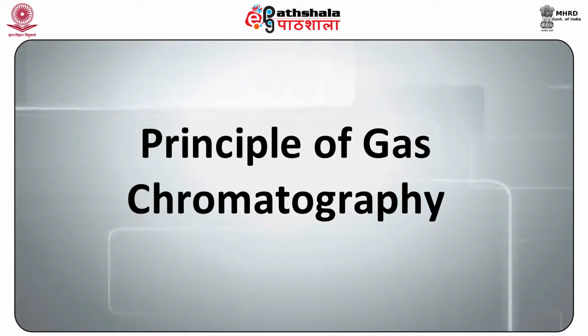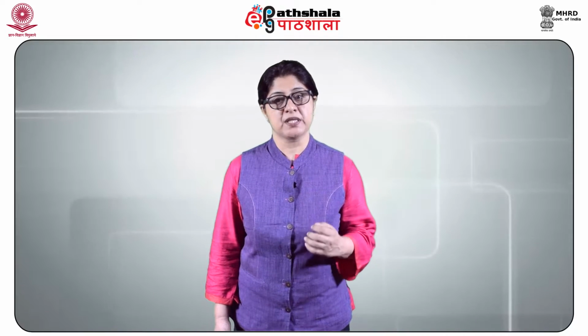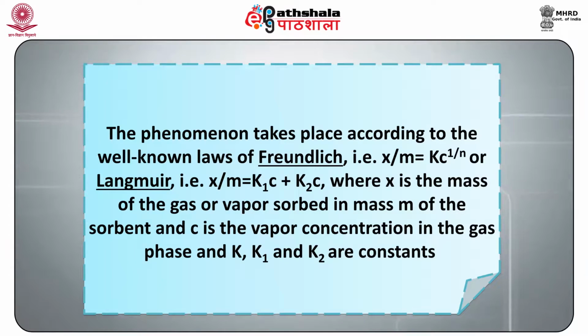Principle of gas chromatography. When gas or vapor comes in contact with an adsorbent, a certain amount of it gets adsorbed on the solid surface. The phenomenon takes place according to the well-known laws of Freundlich, that is x/m = kc^(1/n), or Langmuir, which is x/m = k1c + k2c, where x is the mass of the gas or vapor adsorbed in the mass m of the sorbent, c is the vapor concentration in the gas phase, and k, k1 and k2 are constants.